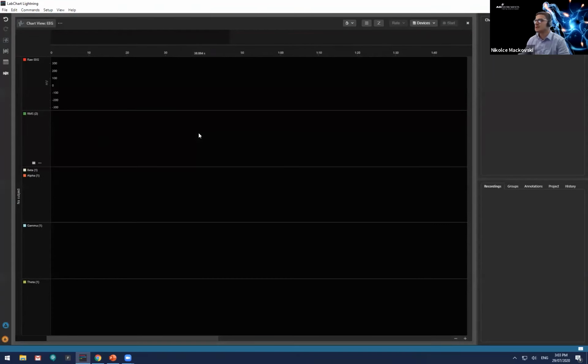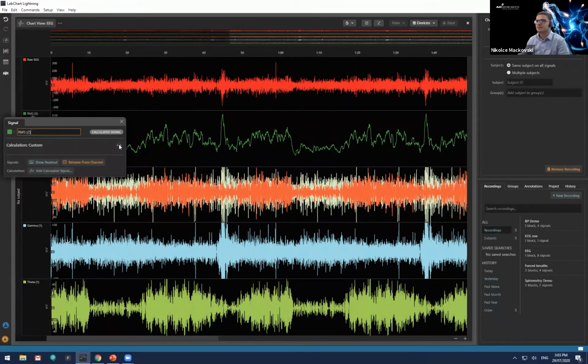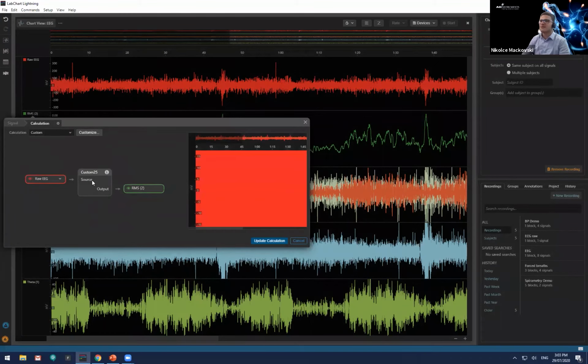So let's just go back to our other project here, the demo project, and I want to talk more about this now. Let's now go back to this. Now you notice here that when I've saved this, it's just giving me a custom 25. It's not giving me any options here. I can't actually do anything.